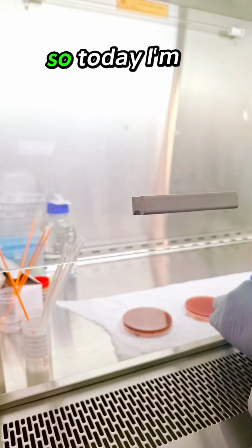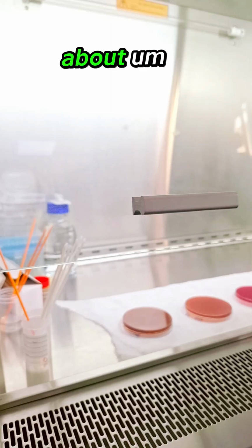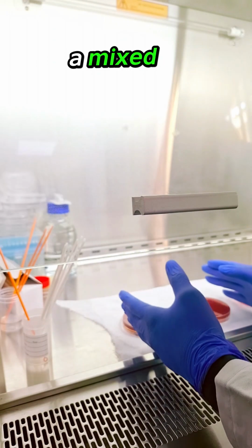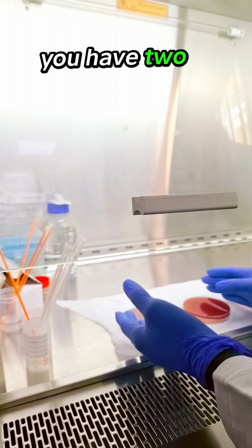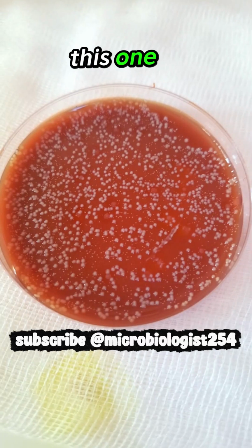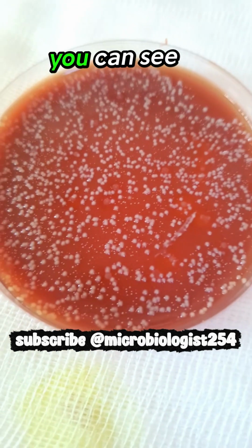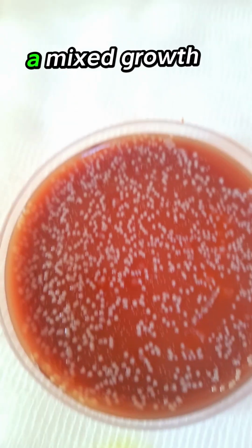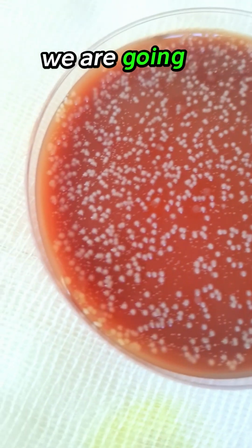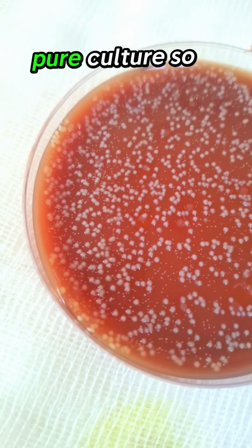Hello guys, today I'm going to show you something very interesting. Look at this case. You have a mixed growth, with two to three different colonies in one plate, like this one. We have a mixed culture here. So we are going to discuss how to separate these mixed colonies to obtain a pure culture.